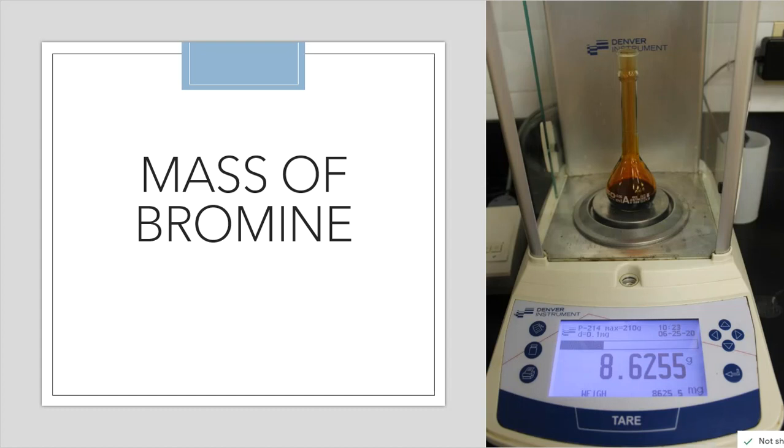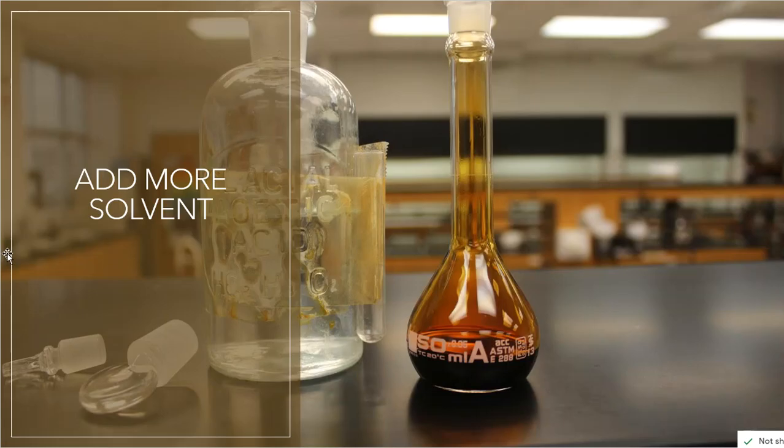In other words, if I did 8 grams exactly, by the time I get finished, I will lose some of that bromine and I will not have a 1 molar solution. It might be extremely weaker. So this is something that I would rather go a little bit over on than trying to get pinpoint 8 grams exactly. So I take this volumetric flask over to the lab counter.